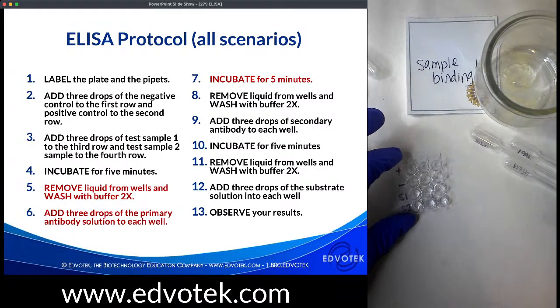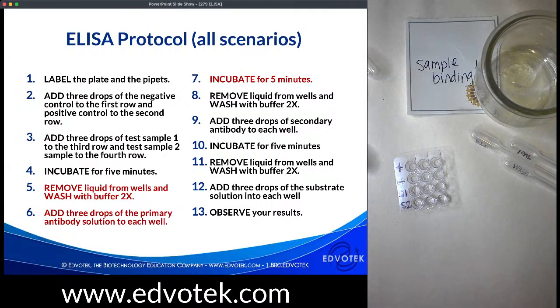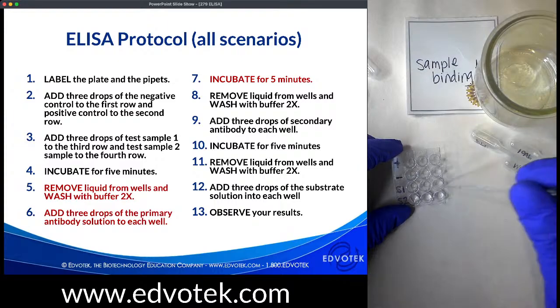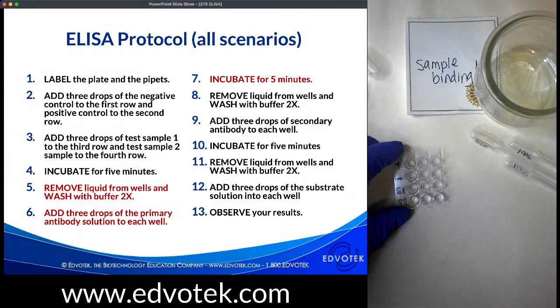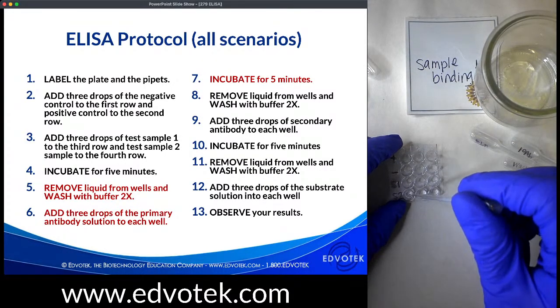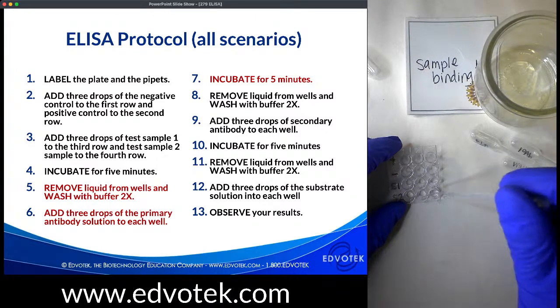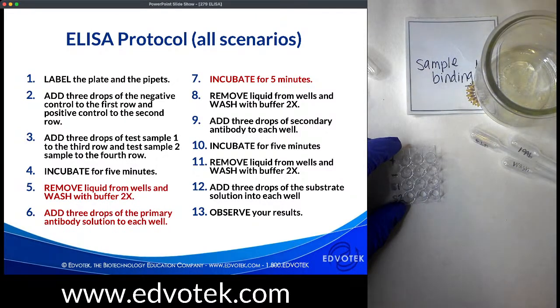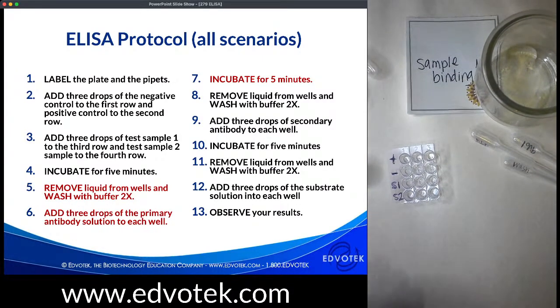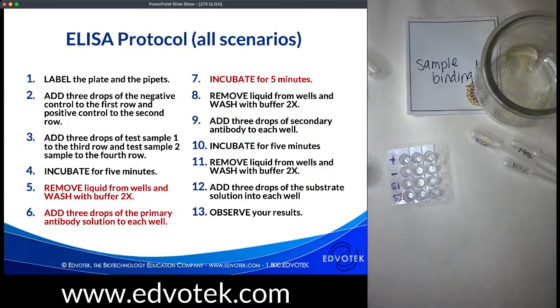It's always good to recognize where you might have a little bit of error. Again, if we see error there, that is a place where you can have your students interpret what they did, what potentially went wrong, and how they would prevent it again the next time. I could prevent knocking my pipettes over a million times by having a beaker to place them in, or by keeping them away from the edge of my surface. If I happen to use the wrong pipette for a sample, we could then say, well, to eliminate cross-contamination, there are specific steps that I would take. And all of these are important.